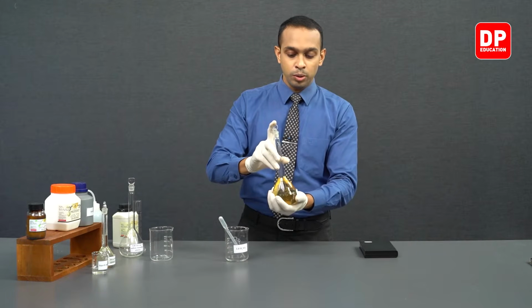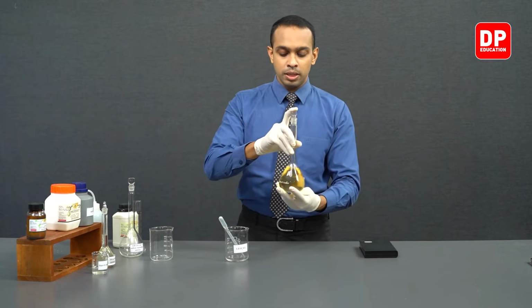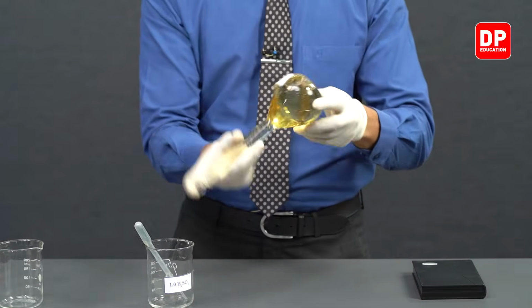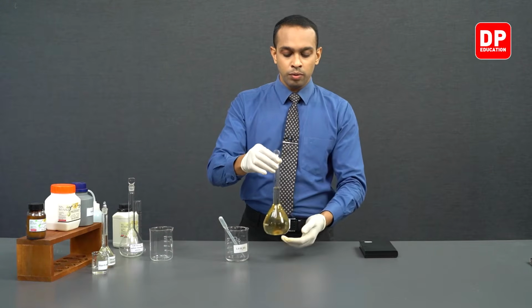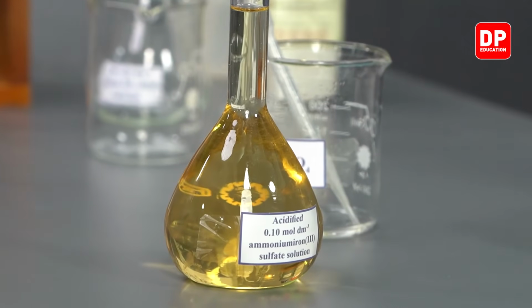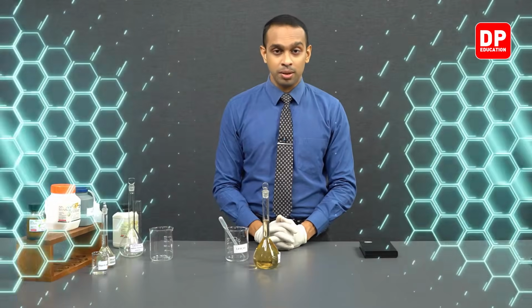But we have one more step to go. We have to close the stopper here, and then we have to mix the solution really well. You can turn it upside down a few times to make sure the solution is mixed really well. So by now we have prepared our acidified 0.1 moles per decimeter cubed ammonium ferric sulfate solution. Let's move on to the next step.